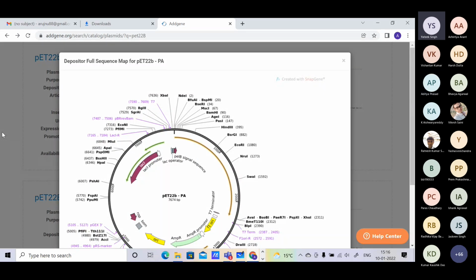Yes. Typically for every clone we streak 10 individual colonies, because it is a bacteria, and bacteria has a very fast rate of evolution. So many of the clones will actually have a mutated gene. You can end up with a mutated gene. So what we do is maintain 5 to 10 colonies at least, so that the clone we are selecting is actually what we wanted, not a mutant one.